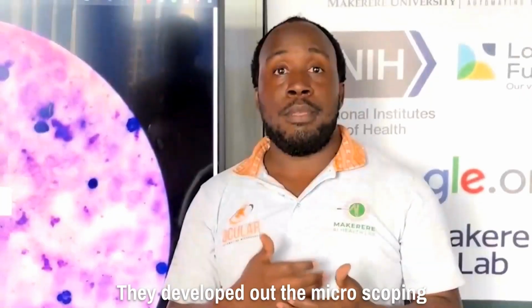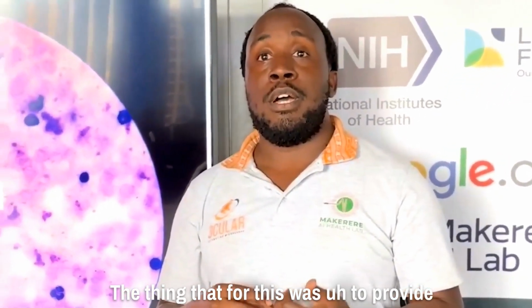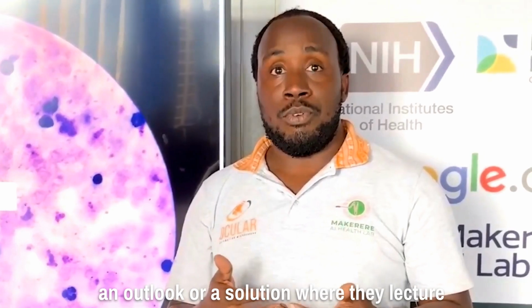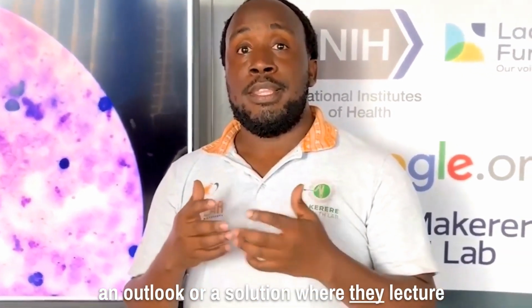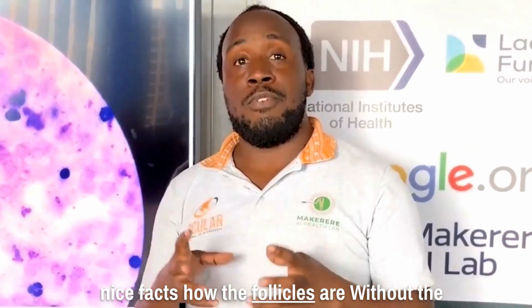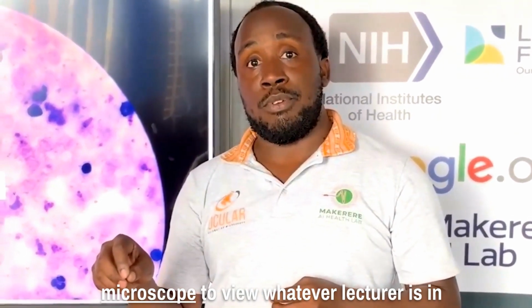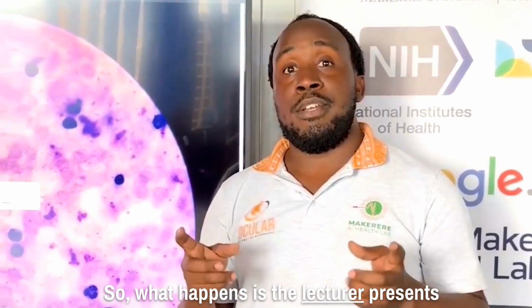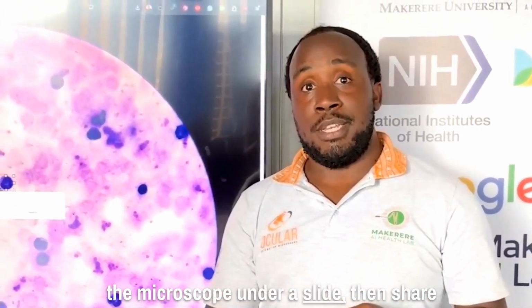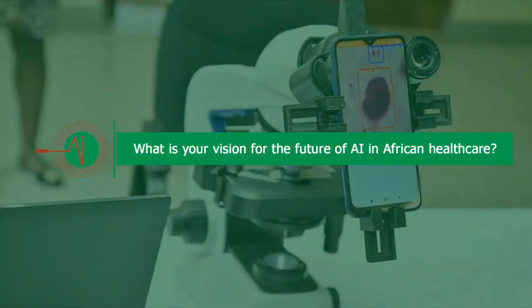I developed the Microscopy Teaching Aid, which is both a web application and desktop application. The thinking for this was to provide a solution where the lecturer can teach the entire classroom given artifacts, how their morphologies are, without the need of the students coming to the microscope. So the lecturer presents the slide under the microscope, then shares that image from the microscope to the desktop.